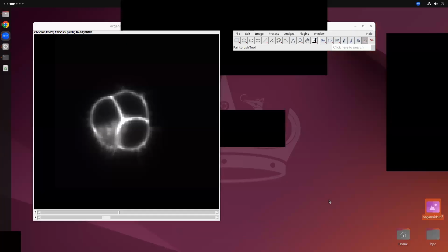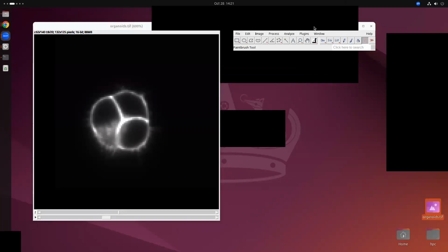So I'm going to share probably my, how do I share the whole screen? Desktop share.